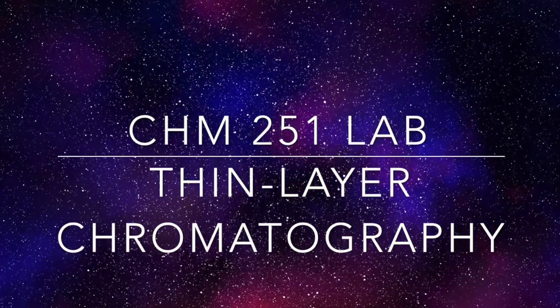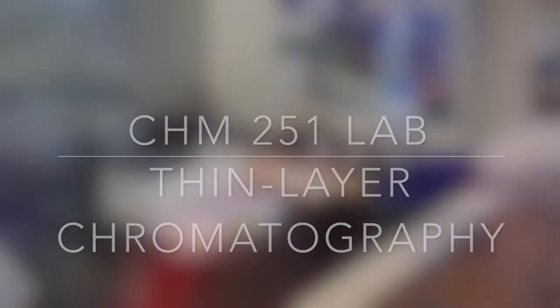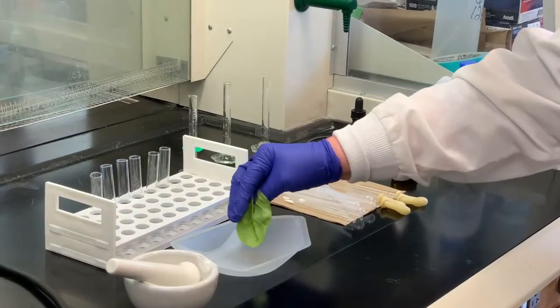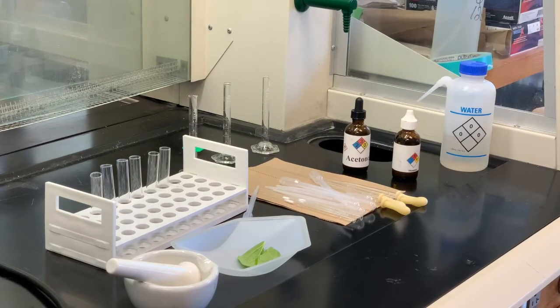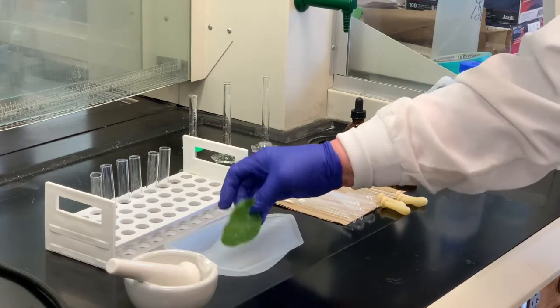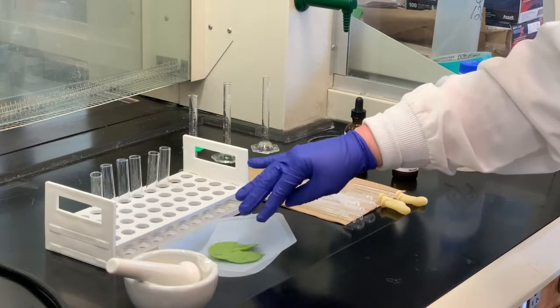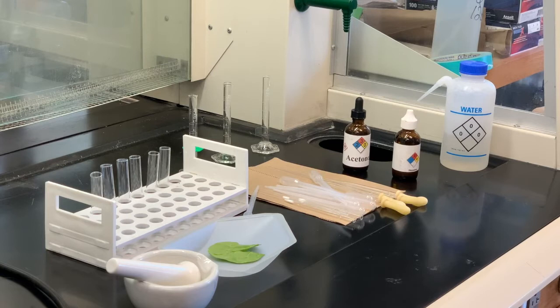Today's lab, we are going to do two different types of experiments. We're going to do an extraction first, where we have around a gram of spinach — it's a good idea to remove the stem, as that has a detrimental effect on the outcome. We'll place the spinach leaf inside the mortar and pestle, add acetone and hexane, grind it, and remove the liquid into a pipette. We're trying to remove chlorophyll from the spinach, and once we have a sufficient amount, we'll move to chromatography to see how many different components are in the chlorophyll.